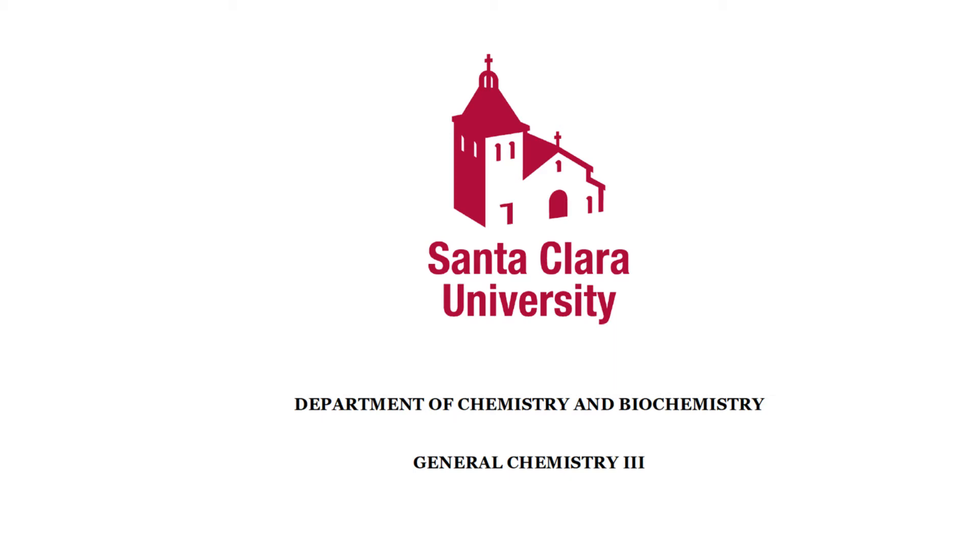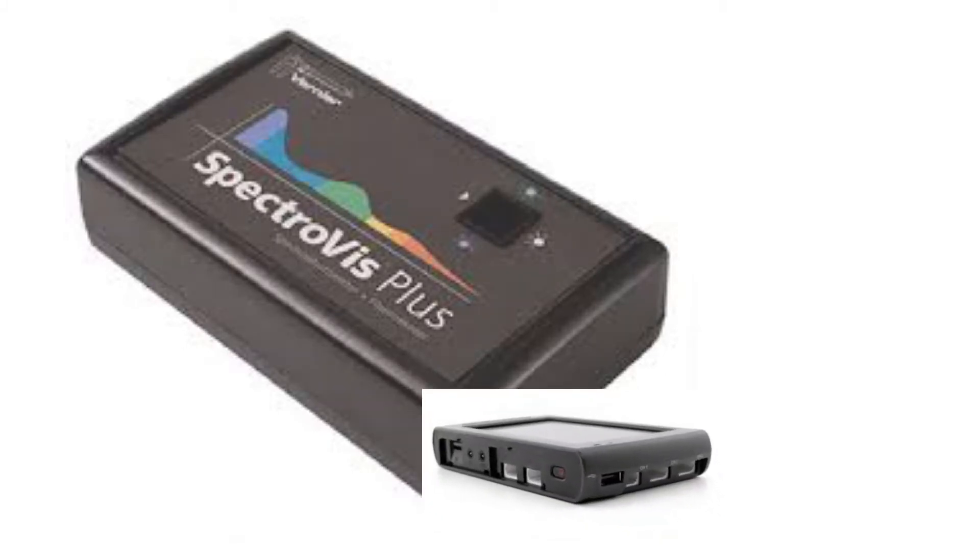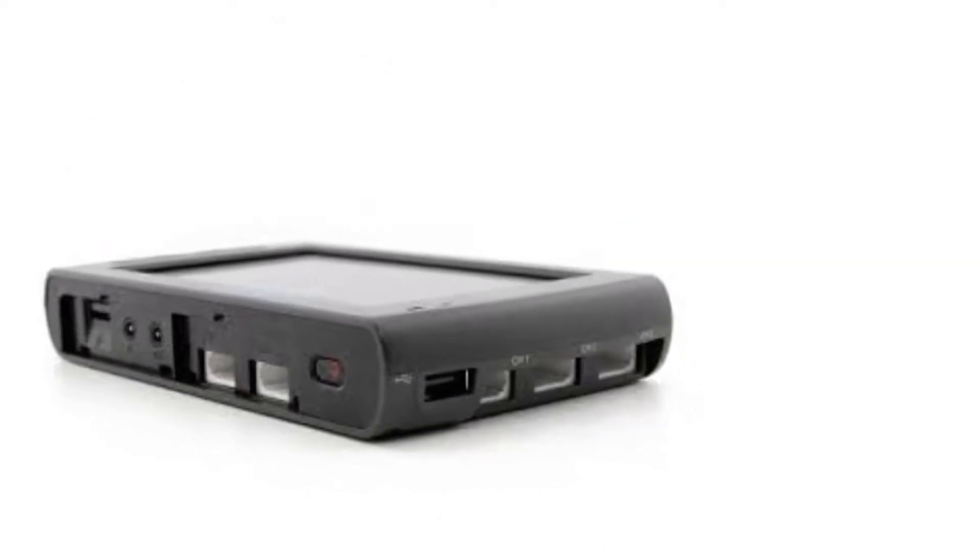In this video, we are going to show you how to use the SpectroViz Plus coupled with the LabQuest 2 to determine the concentration of an unknown sample by UV-Vis Spectroscopy.